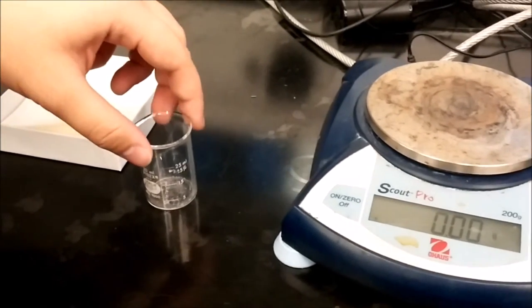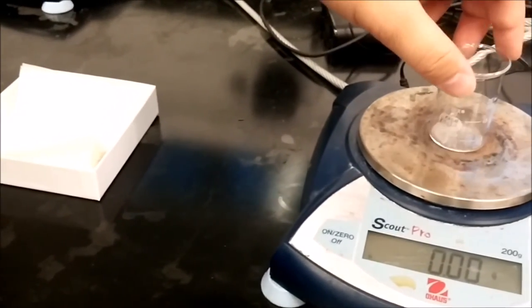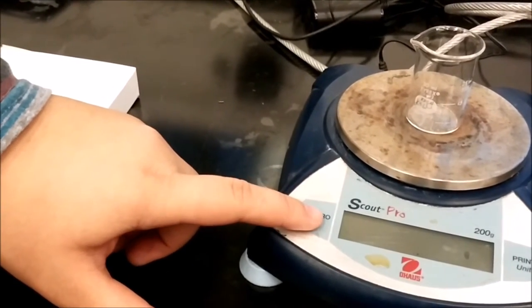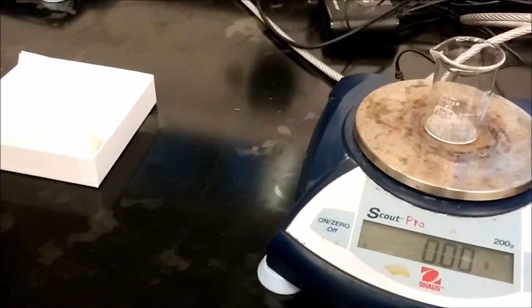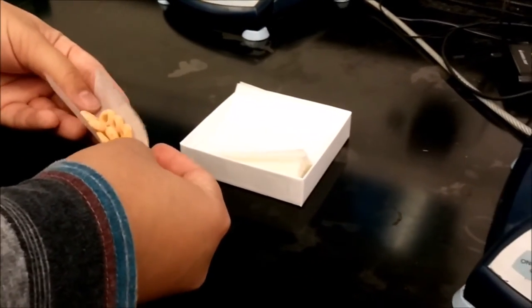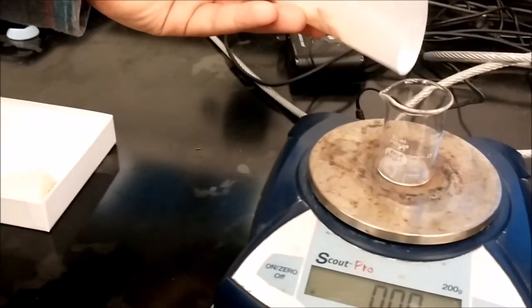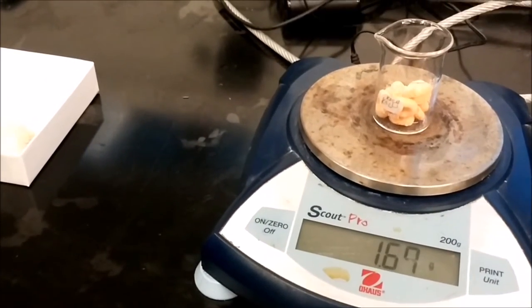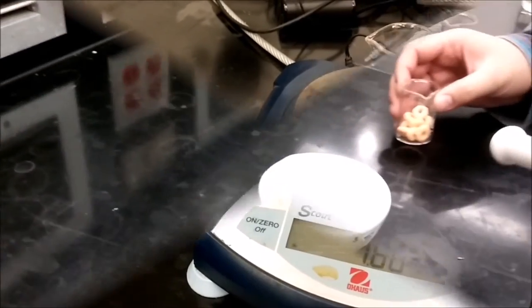Finally, we're at the Fruit Loop stage. You'll want to tare the scale to the mass of an empty beaker first. Then, without removing it, add your Fruit Loops. This will give you an accurate mass of 10 Fruit Loops. Be sure the Fruit Loops are the same color as the dye you've been using. Record this mass for calculations later.